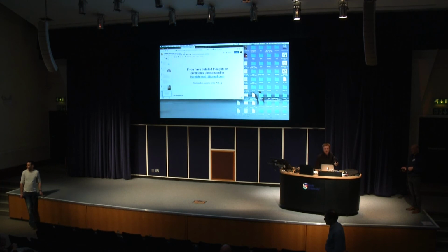Should have clarified. No, it doesn't. What's the question? Oh, sorry. The question was, does Coot VR have all the features of Coot? Not right now. But you can build a protein model. Can you build a protein? Yeah, you can. You totally could. It would not be better than using Coot right now, but you could do it.